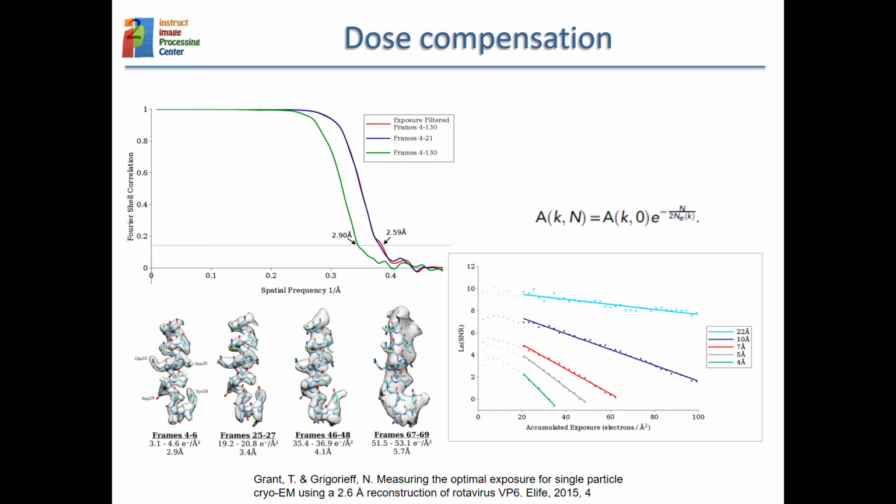And these damage coefficients have been incorporated into the motion correction algorithms so that you can give less weight to the final frames. But as I said before, these coefficients were very accurately measured, but they are not universal for all microscopes, all samples, all acquisitions in the world and history.